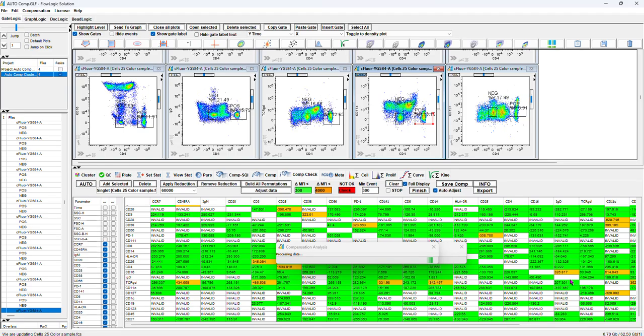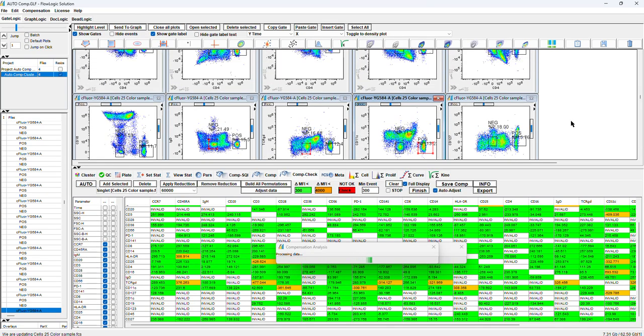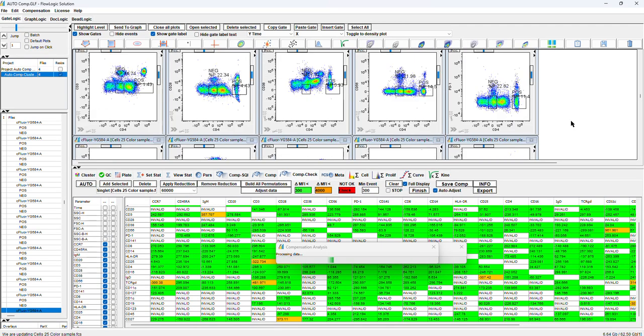All the yellow get adjusted, and you can see that the tendency of the gate is moving toward the end of the data. You can see just the movement now for this gate. It will take another few minutes to get all done.